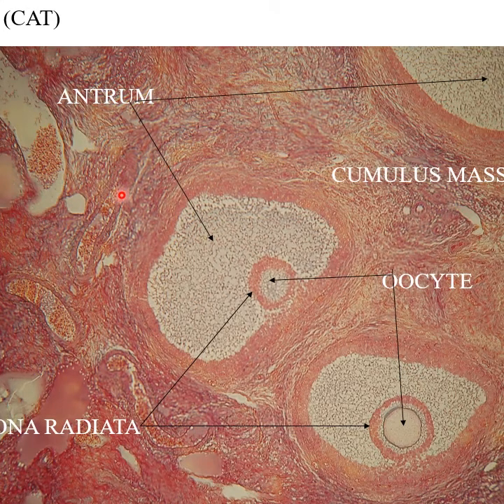This one, again, is another ovary. This is so we can look at some details of some of the structures in a couple of weeks. Again, you'll have oocyte or egg. You'll have some corona radiata, some granulosa cells there. This whole thing's a follicle. They have different stages. We'll look at that a little later. For now, again, it's still just the ovary.